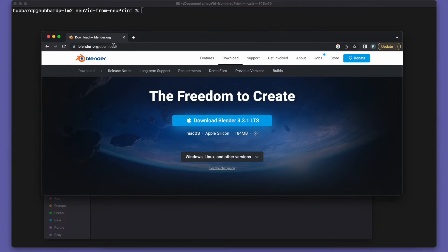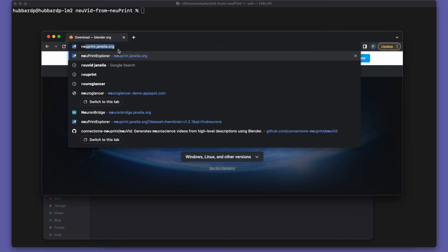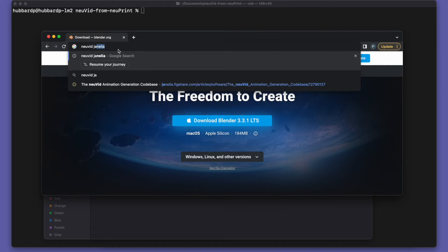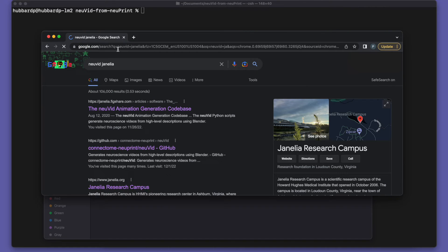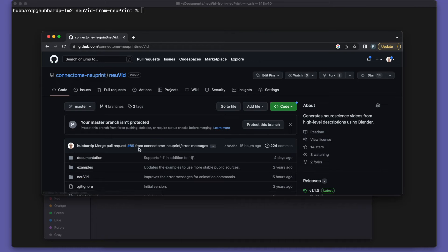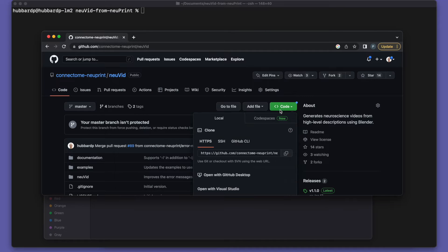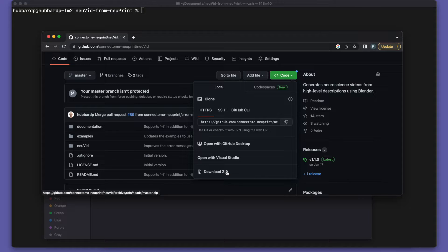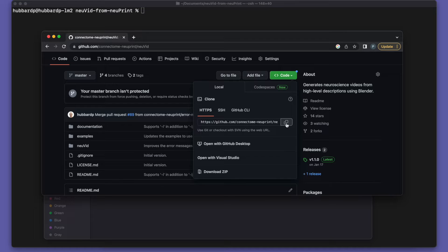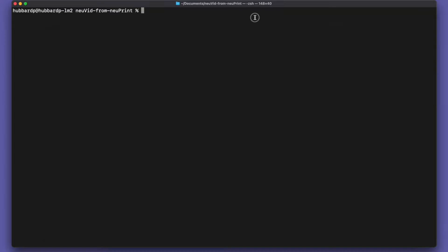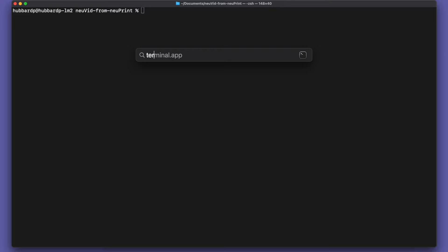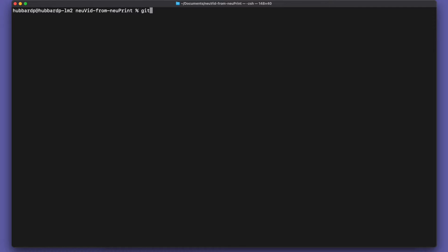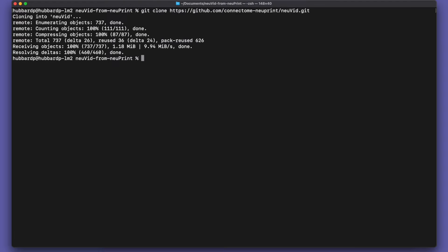So let's go to the next step of installing NuVid. You can search for the GitHub site and go to the code button. Now we could download a zip file and extract it to get the scripts for NuVid, but a better approach is to use Git. So we'll copy the Git URL and then go to a terminal. If you don't have a terminal open, you can do command spacebar and type terminal. And then in the terminal, type git clone and then paste the URL you copied. And that gives you the code. Git should be installed by default on Mac and Linux systems and it's easy to install on Windows.